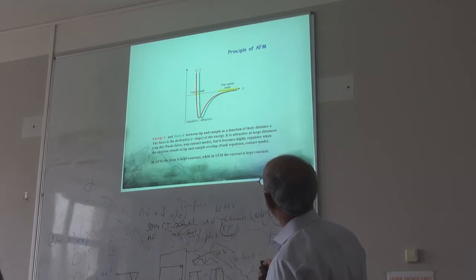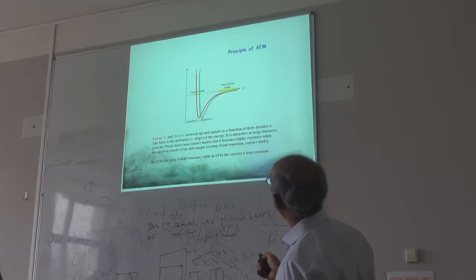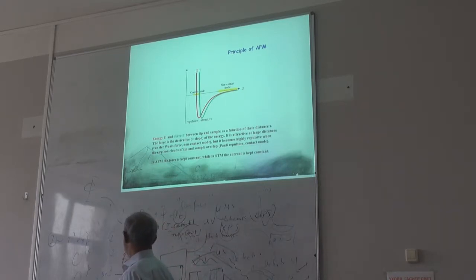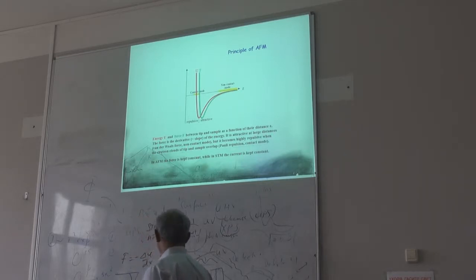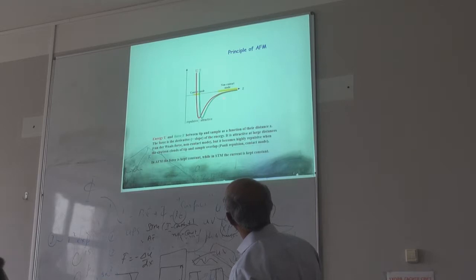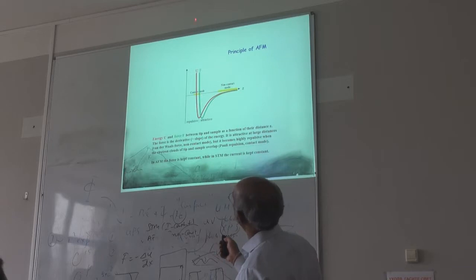You can see in this range, this becomes positive, this becomes negative here. So this is the force actually. Force is negative dE over dx, right? So depending on what mode, this is where you use the non-contact mode. So that is your force is negative. Yeah, in the contact mode, usually we use in this way, in the positive mode.